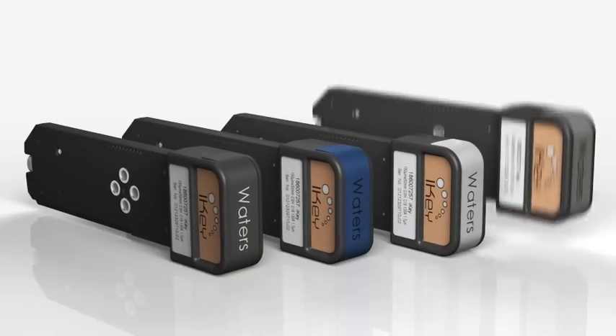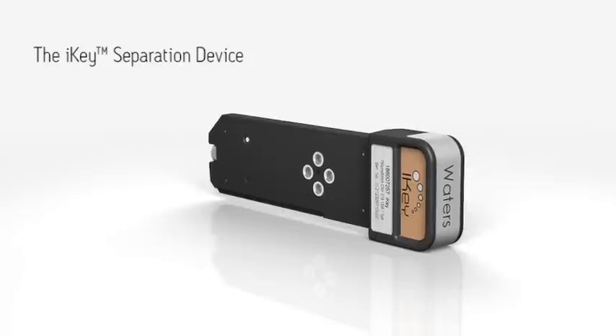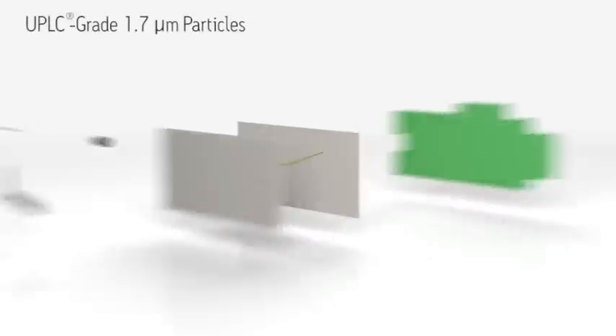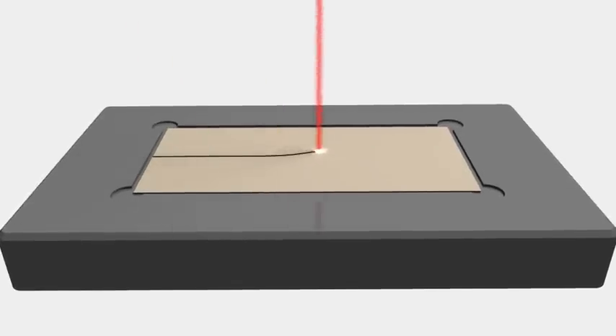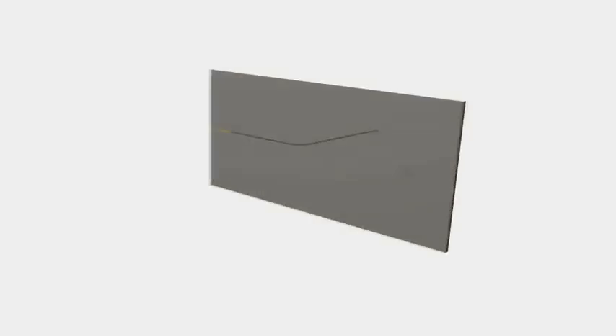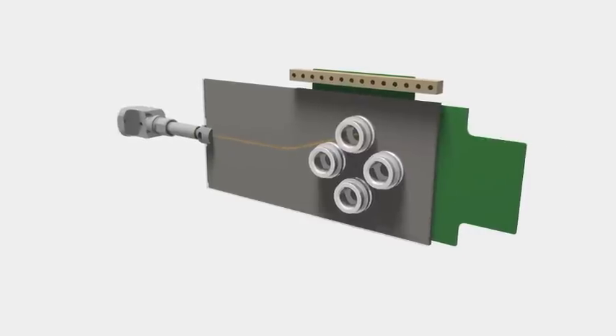Enabled by the iKey — a high-pressure co-fired ceramic microfluidic separation device packed with UPLC grade 1.7 micron particles. The iKey, manufactured to exacting specifications, contains the fluidic connections, electronics, ESI interface, and column heater.